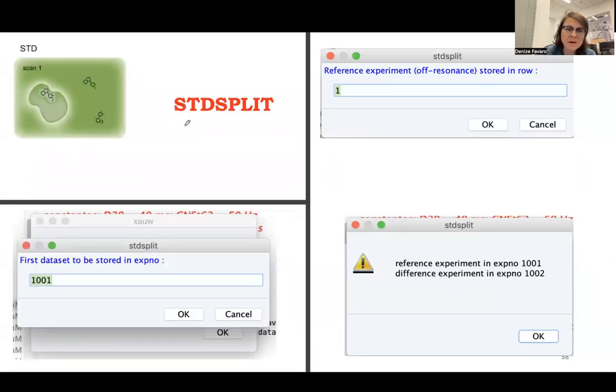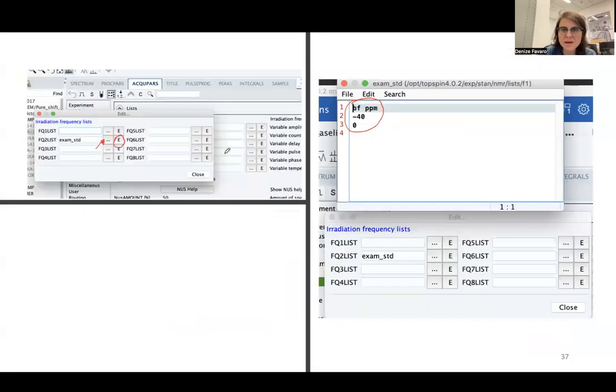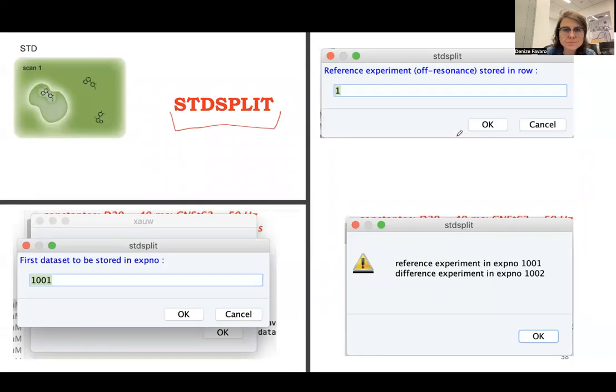And the processing is STD split. One important thing is as I have two different points, I have my TD. This is a pseudo 2D experiment. So my TD in F1, as I have only two points on my frequency list, is equal to two. So STD split is a macro and this macro actually splits your data into reference and the difference.